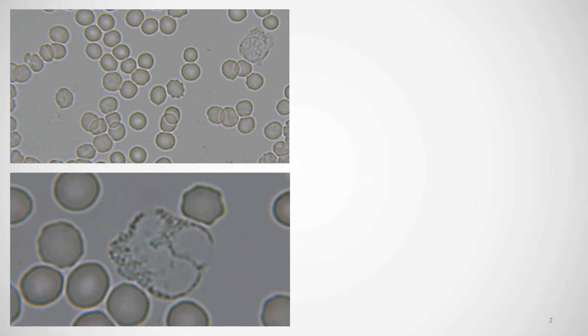So this image that's on the screen at the moment is just a live blood sample in bright field. And there are various things that we look for here. We actually have some red blood cells. So those are the spheres or circles that are visible in the screen there. And then the grayish structure towards the upper right-hand side there is a white blood cell. So there are various indicators that we look for and deviations from normal that are interpreted as specific implications in the system.